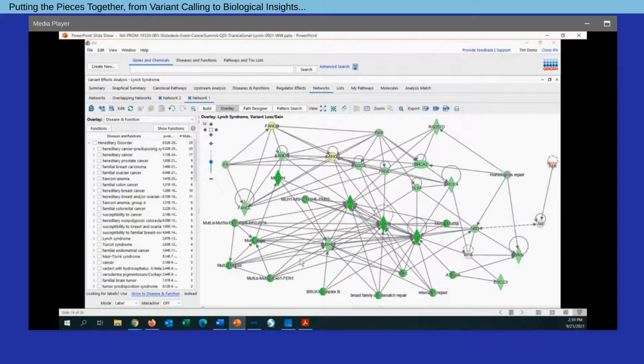And so with this data set, when we have a set of variants with loss of function, we have the ability to understand the genes in which these loss of function variants occur. What pathways might they be related to? And what we're looking at here is something we call networks. So taking this set of genes that have loss of function variants and asking, based on our known set of interactions for these genes from the knowledge base, what are genes that could occur in an interaction network across my set of genes? So how they might uniquely interact together in the context of this cohort of Lynch syndrome patients.